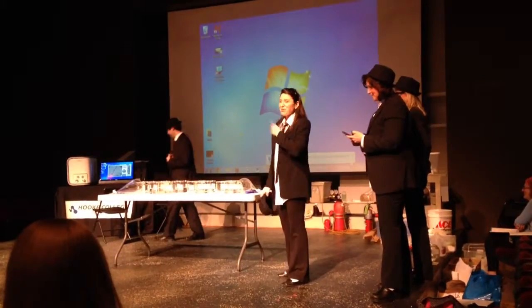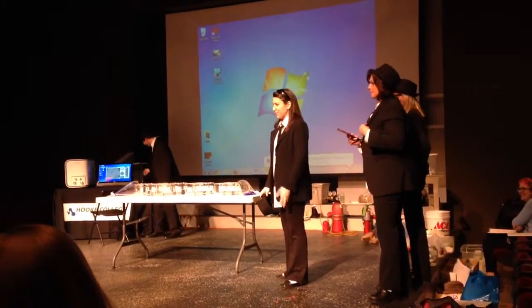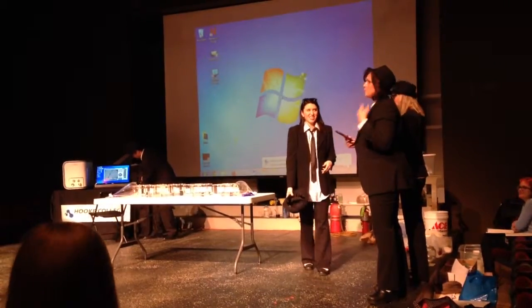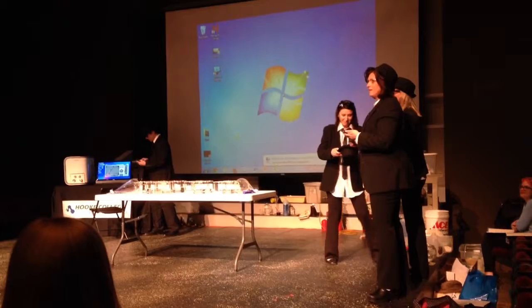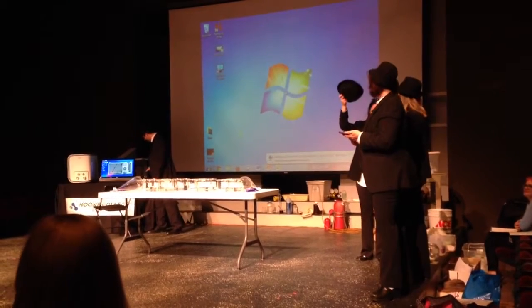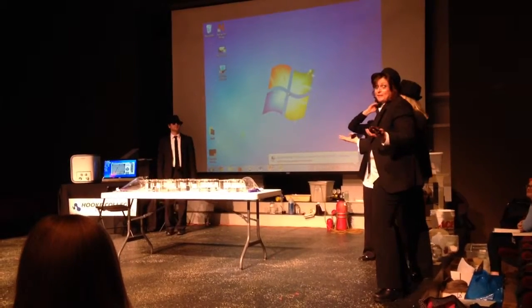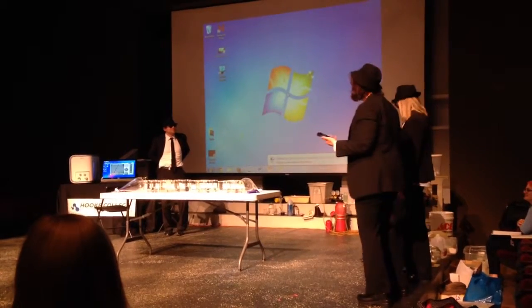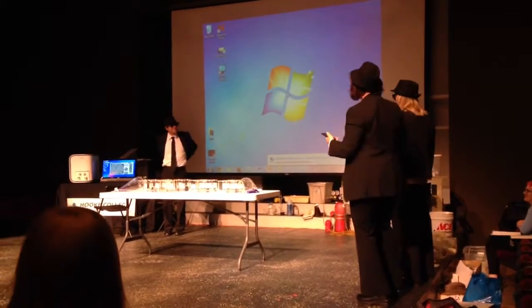That was volunteer. But Flynn's iodine clock demo is in there for the recipe and such. We did this last Friday at MSTA for morning chemistry, and this was the week after, and we had all gone to the Goodwill, so here we go again. All right, so we'll see if we remember.